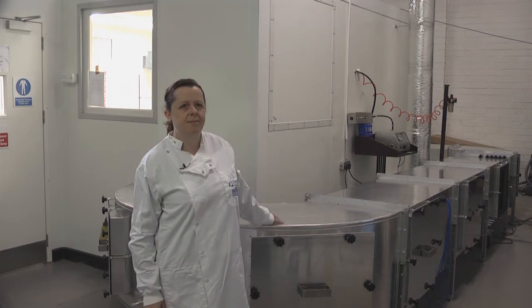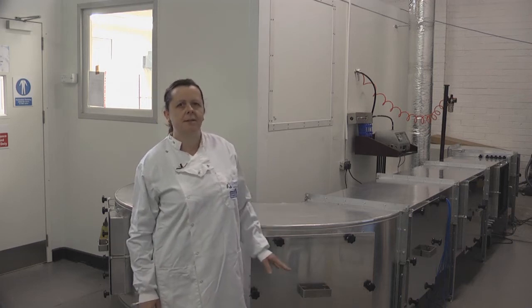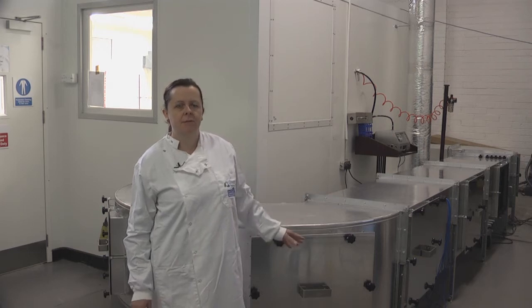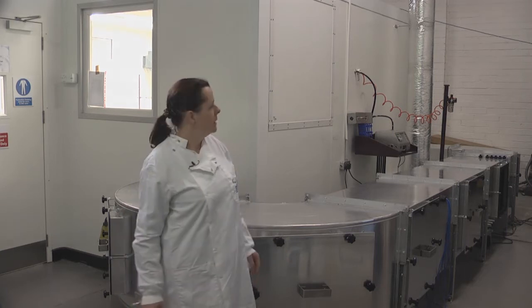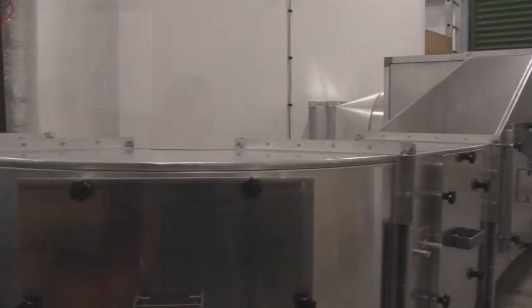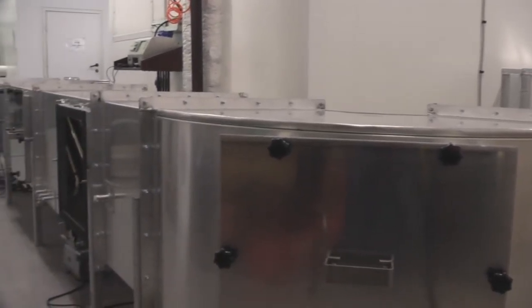The ASHRAE test rig is built from aluminium, so it's very easy to clean down, and has a smooth inside surface which is suitable for introducing microorganisms because it can be easily cleaned down afterwards. The test rig flows from the back of the chamber around to the front of the chamber.